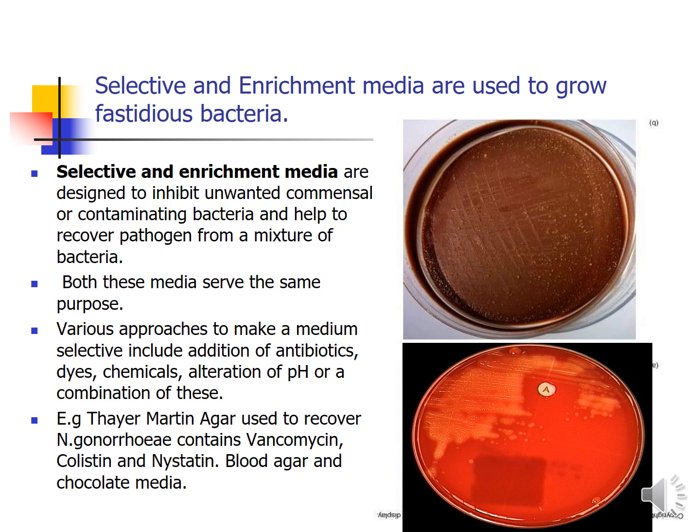Selective and enrichment media are designed to inhibit unwanted commensals and or contaminating bacteria and help to recover pathogens from a mixture of bacteria. Both these media serve the same purpose. Various approaches are used to make a medium selective: the addition of antibiotics, dyes, chemicals, alteration in pH, and a combination of these. Any combination of these will make the medium selective.